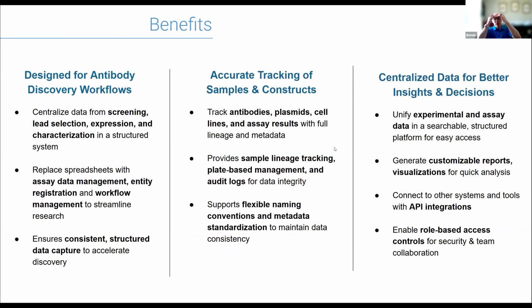So what you really want is a solution that provides some of the following benefits. I was just talking about that centralized application, where you can register the entities that you're investigating, and all of the associated data with it. You want that additional data to be properly associated. You want it to be integrated with the samples that you're dealing with, the plates that you're working on, the assay data that you've generated, and you want that to include the analyses, the hit selection criteria, the things that you're operating on at a bench level.